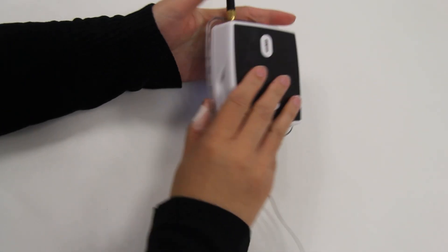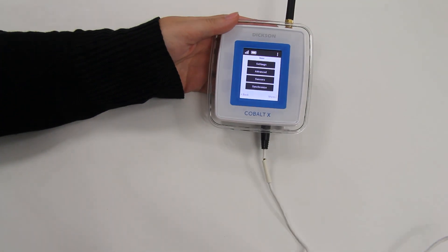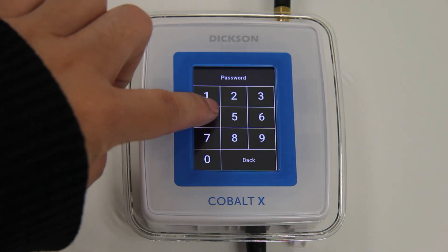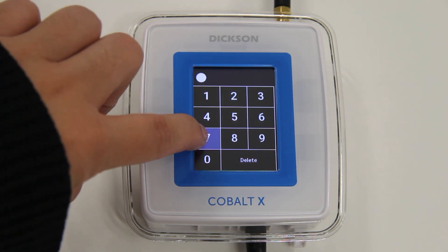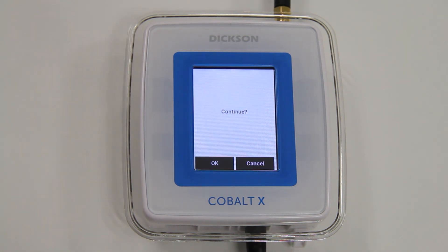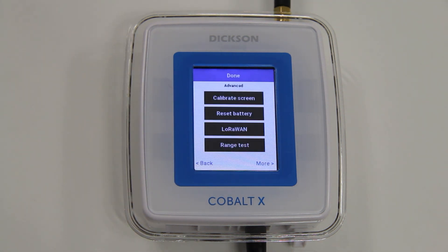On the device settings, you must now reset the battery counter. Press the menu icon, press the Advanced button, enter your PIN code, and press the Reset Battery button. Press OK to continue. This will reset your battery to 100%.